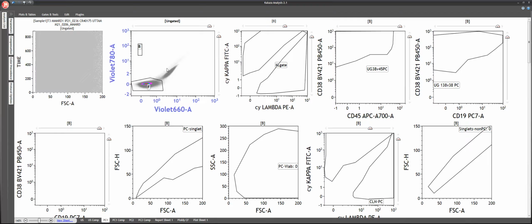So what we do is, first of all, we evaluate plasma cells. Like we have seen in diagnostics, we go with CD38, CD138, and CD45. Identify plasma cells, clean them a little bit, and then look for antigen expression. Especially in the cytoplasmic tube, we have adopted a reverse gating strategy. And what is that? We start first with kappa and lambda.